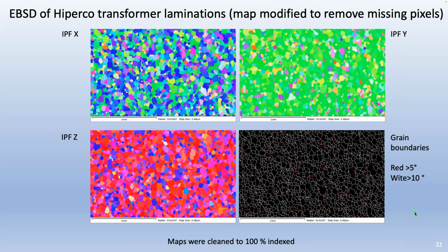So I would try to compare two different sample preparation techniques and see if you get a similar answer. Again, electropolishing seems to be, in my mind, the gold standard of sample prep. So if you can electropolish the sample and take a map and compare that to your ion beam milled or whatever other mechanical polishing technique you're using, I think that'll tell you an awful lot. If they look the same, then you can be pretty certain you're not introducing too many additional twins or deformation structures into the sample. If they look very different, then you need to stop and start over and start clearly thinking about sample prep and what you're doing.